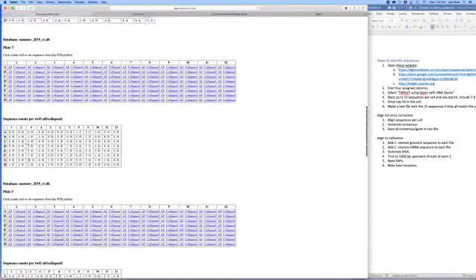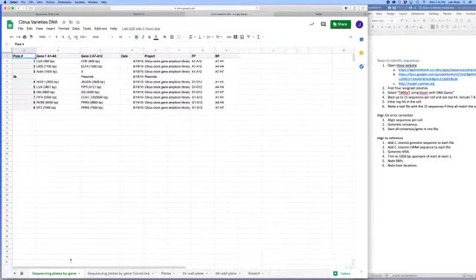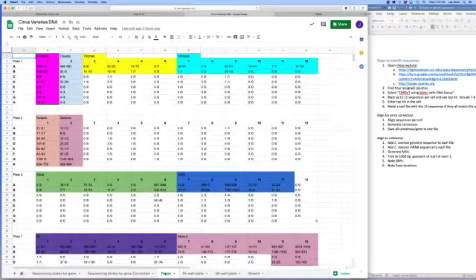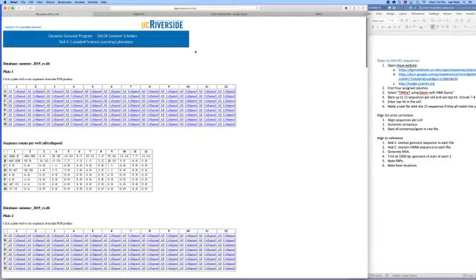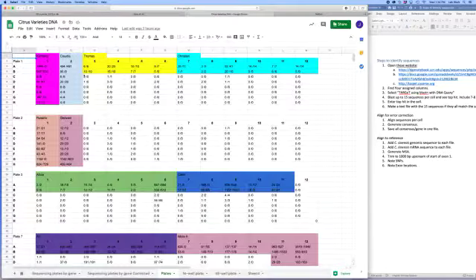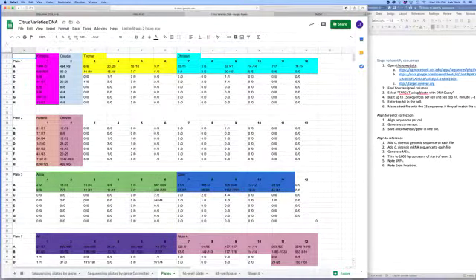Okay, and what I've done is gone through, and on this tab down here, if you click on plates, this is the counts again that you saw here. And what I've done is assigned these to various students. Everybody's got roughly the same number of sequences to look at, and you don't have to look at all 1800. I'll go through how many to look at in a moment.